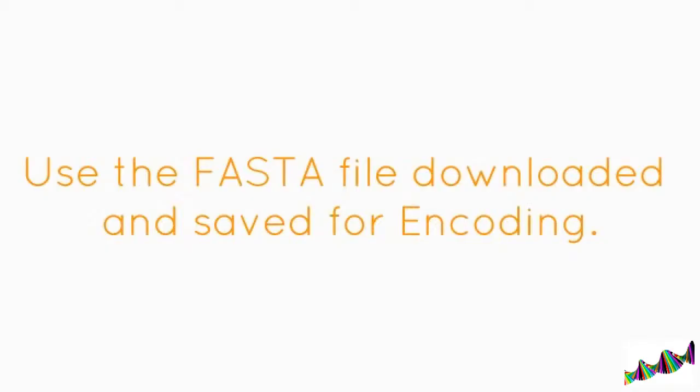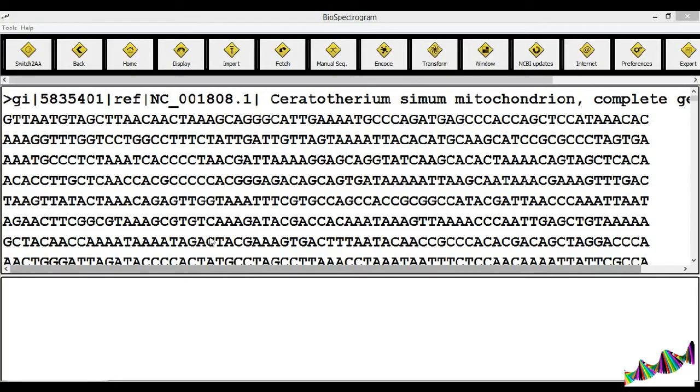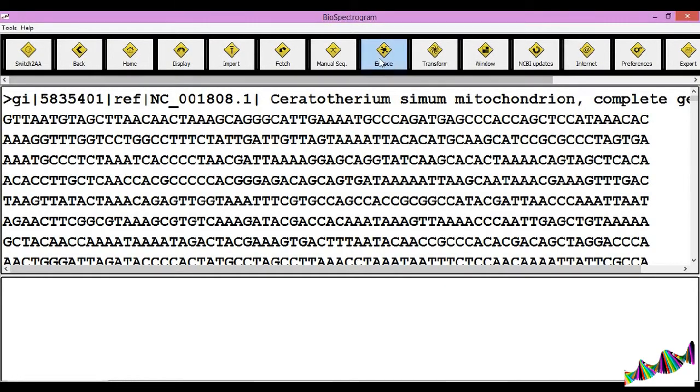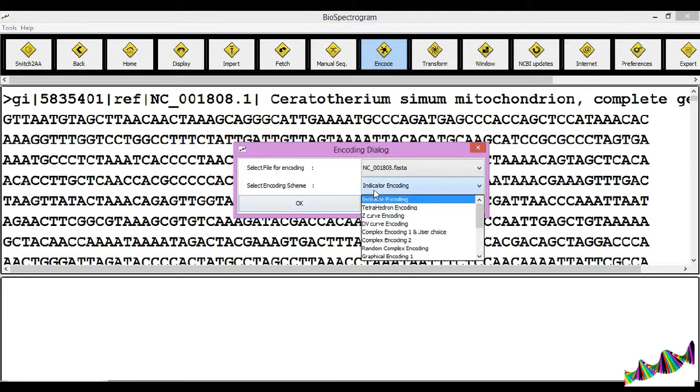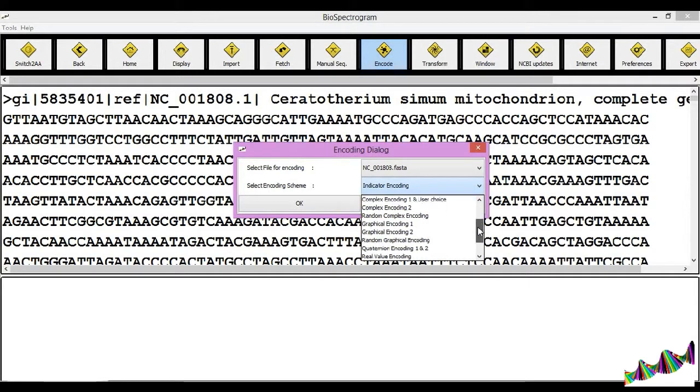Use the FASTA file downloaded and saved for encoding. Click on the encode icon button. Select the FASTA file that you wish to encode and the type of encoding.